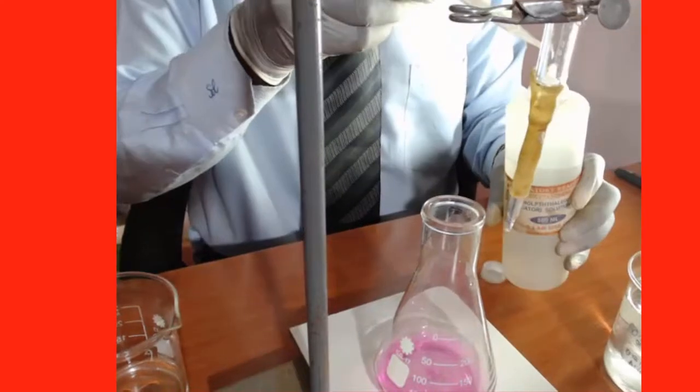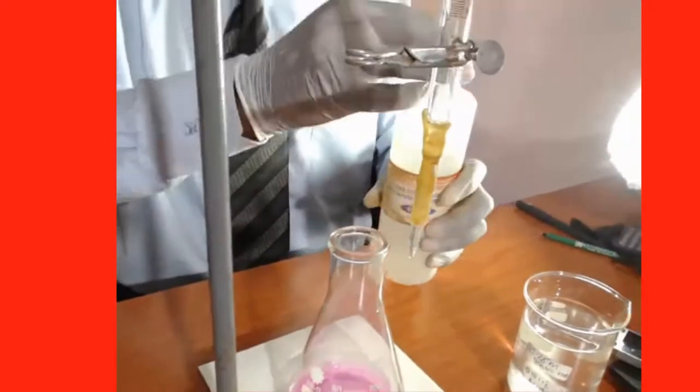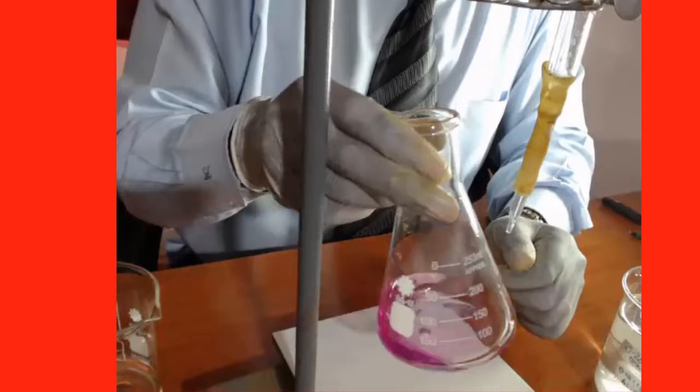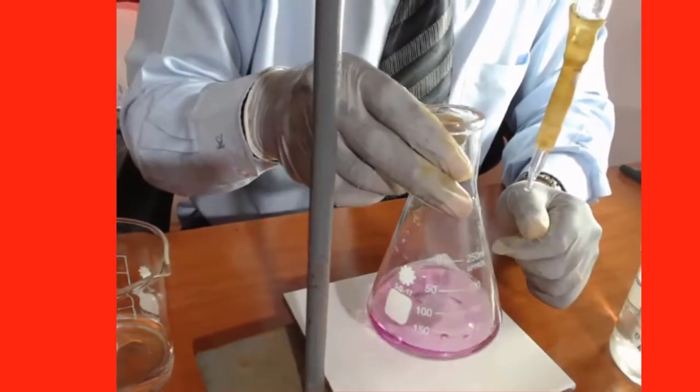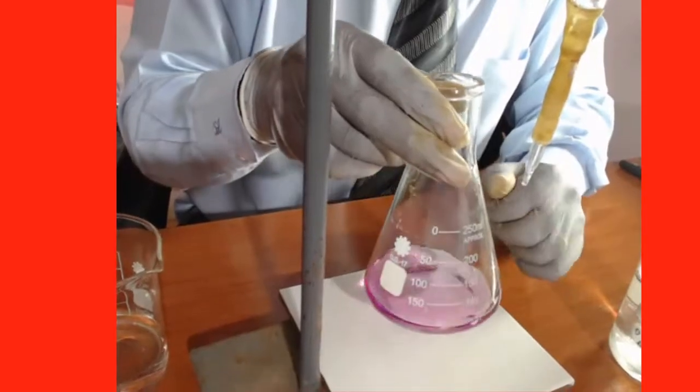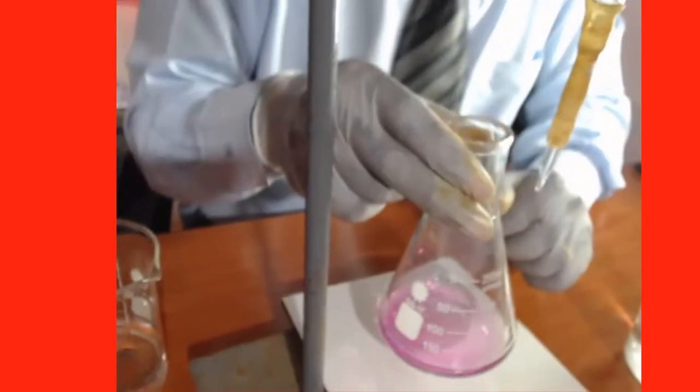We have our indicator. Phenolphthalein indicator changes all basic solutions, all alkaline solutions, to pink, and that's why our sodium hydroxide is turning pink.